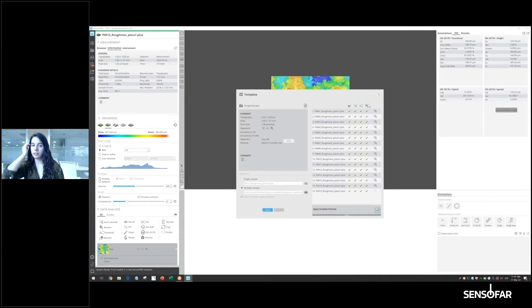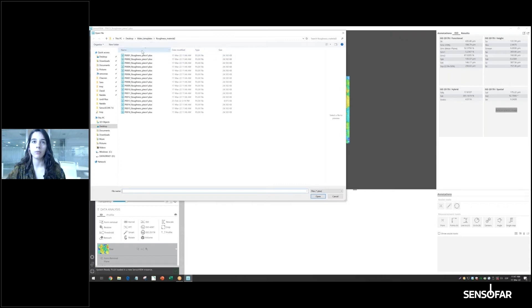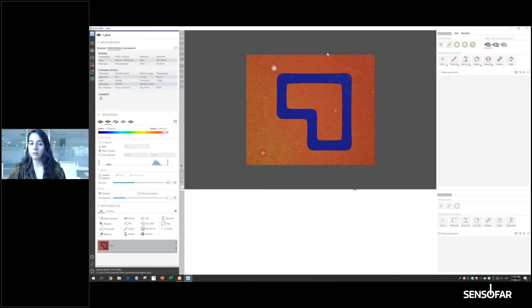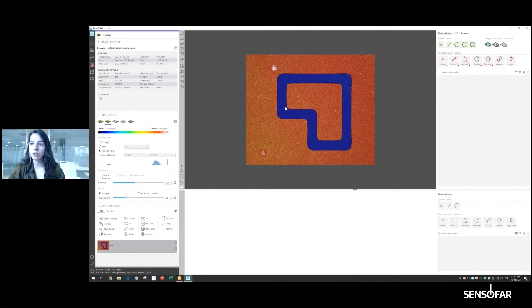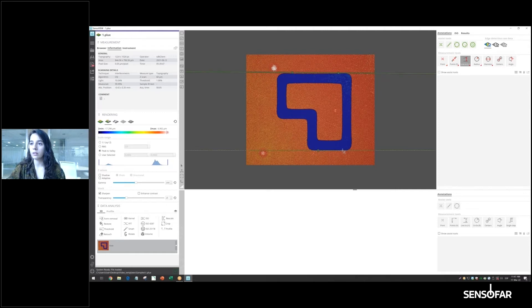Now we move on to critical dimensions. Let's open the file for critical dimensions. When creating a template for critical dimensions, the feature of interest needs to be in a very similar place to the original PLuX file used for the template. We're going to measure the distance on the contour using automatic edge detection, dragging between two points.